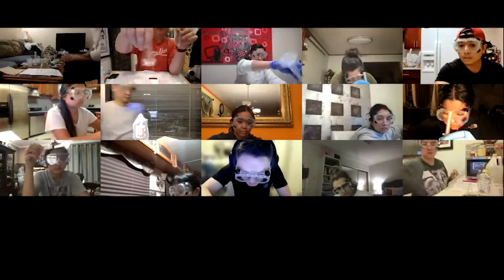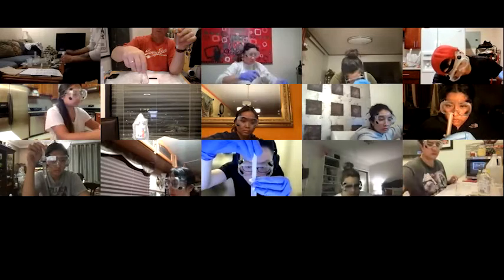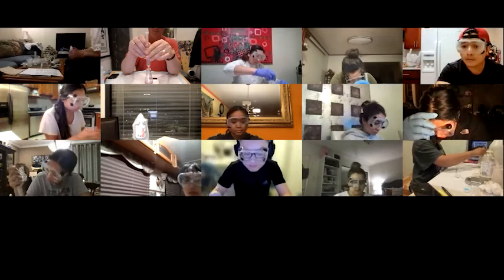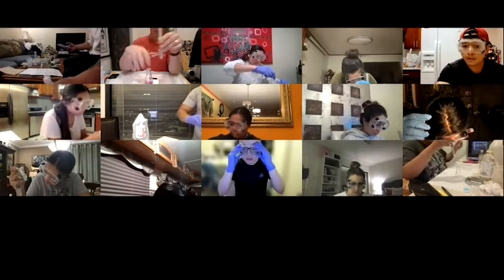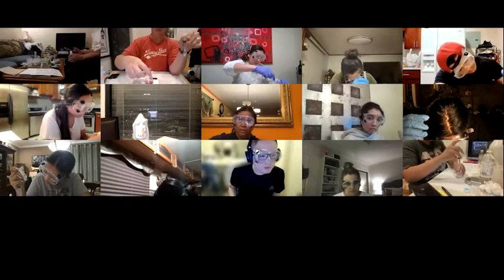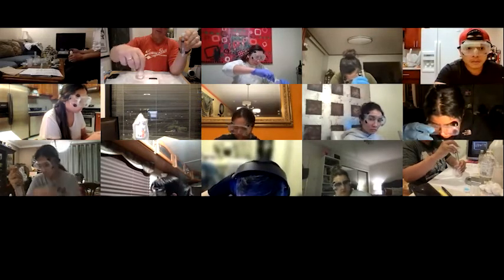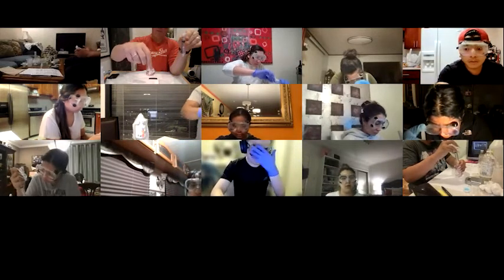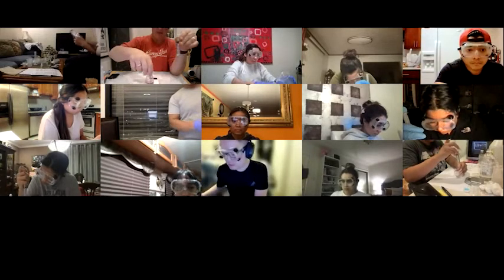Get a pink color, swirl it, goes away. Now, if you get any acid or any base on the side, just swirl that some more. I think a blue color, what the hell is that? So you see it's getting a little bit darker, but still not pink, I would say.